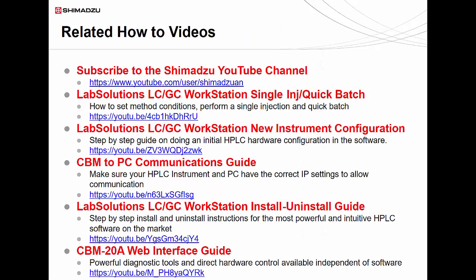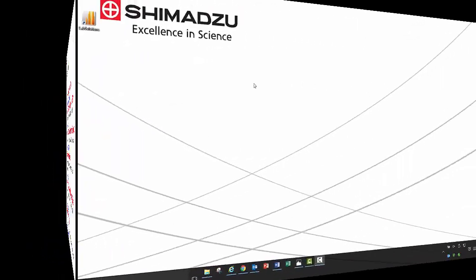In the previous video, we showed setting method conditions and performing data acquisitions. Now that you have acquired your data, in this video we will go over some basic data analysis features that will help you generate meaningful results with your data.